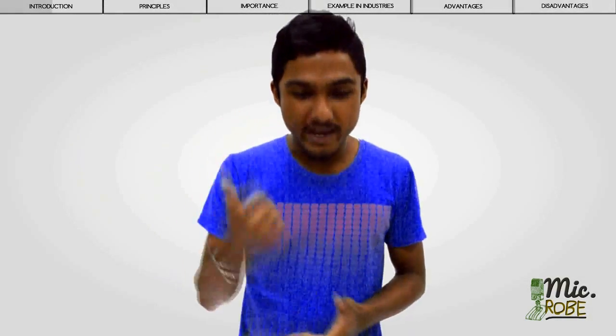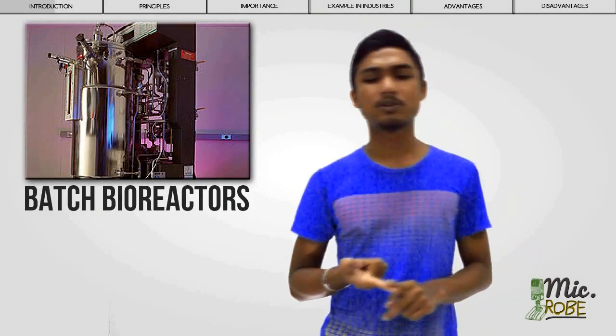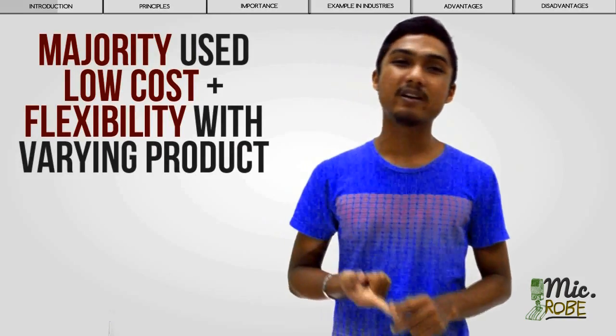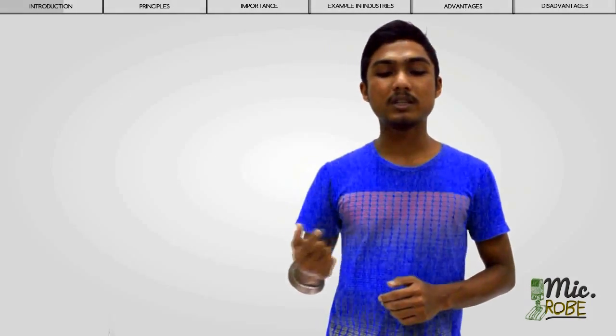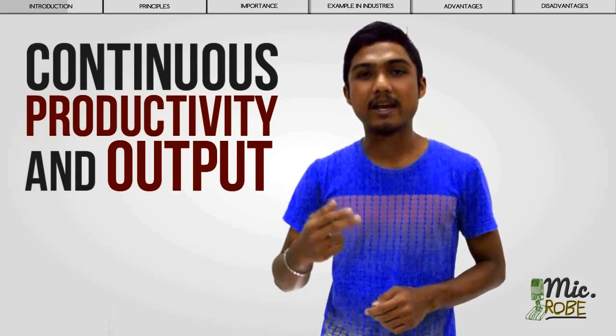We have batch bioreactor, which is the majority used, maybe because of the low cost and the flexibility with varying product offered. The second one is continuous, in which the culture medium of microorganism is continuously fed into the bioreactor, thus resulting in continuous productivity and output.